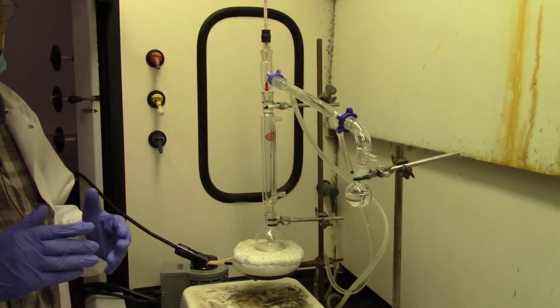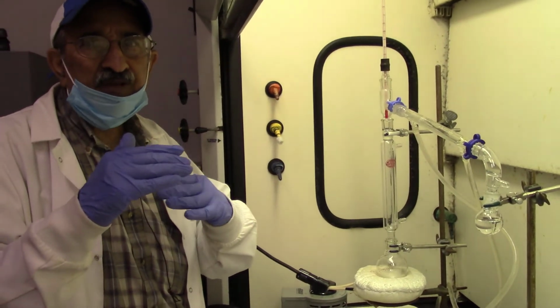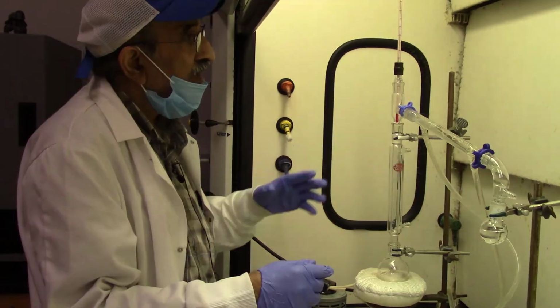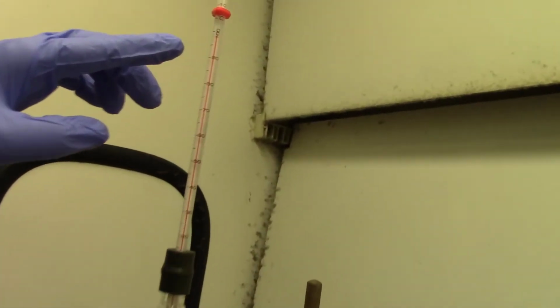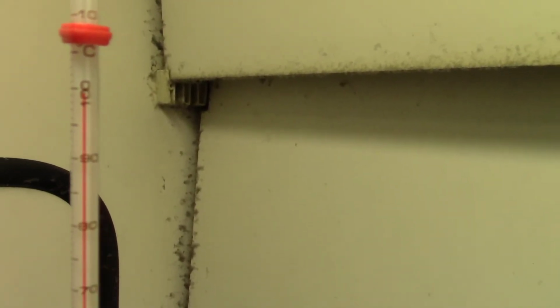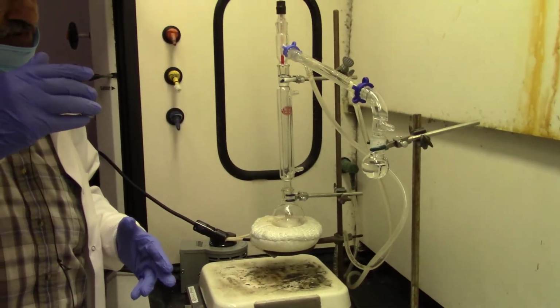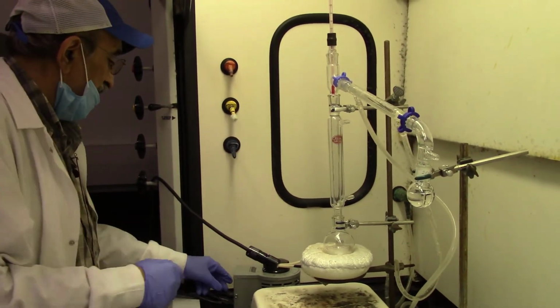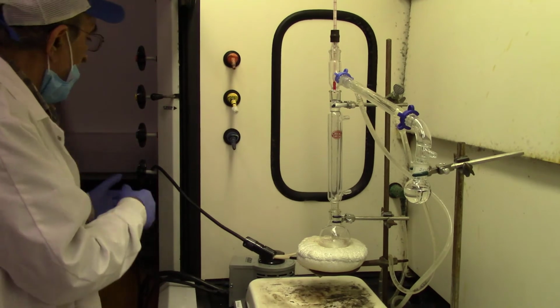Now this is the second fraction of the distillate that I have collected in the 25 ml round bottom flask, and this fraction is between 73 Celsius all the way to 99 degrees Celsius. This fraction between 73 to 99 should have a little bit less hexane compared to the first fraction. First fraction was between 69 to 73, and must have almost pure hexane. This one is between 73 to 99.